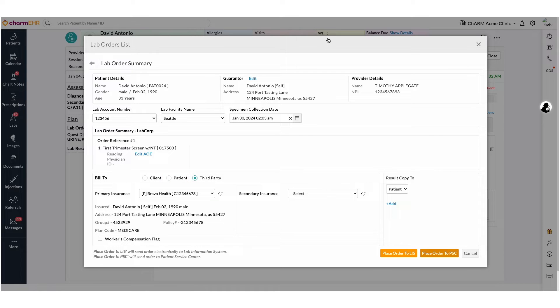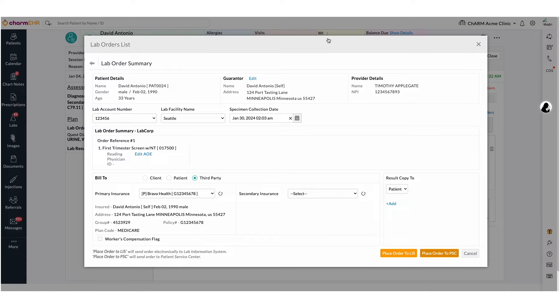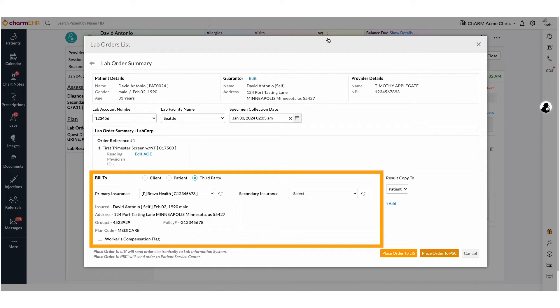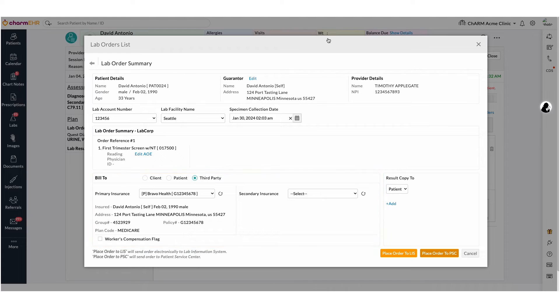When a patient visits PSC, LabCorp will collect the insurance details directly from the patient. If you have an in-house lab specimen collection and transmission, you will have to enter insurance card details for the third party billing type. The lab could claim the amount directly from the insurance company or payer.